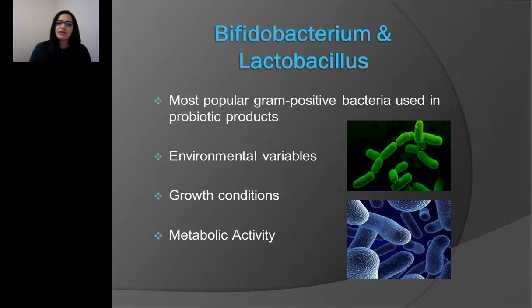So usually the 2 different types of species that we deal with in the manufacture of these supplements are Bifidobacterium and Lactobacillus. And just to give you a little overview about these 2 species, they are really challenging at times, because when we incubate these samples, if we have single colonies or single species on a plate, the Lactobacillus usually can be differentiated from the Bifidobacterium.